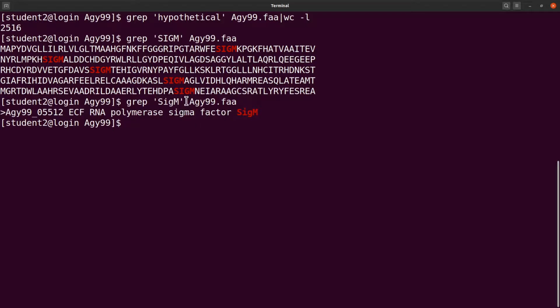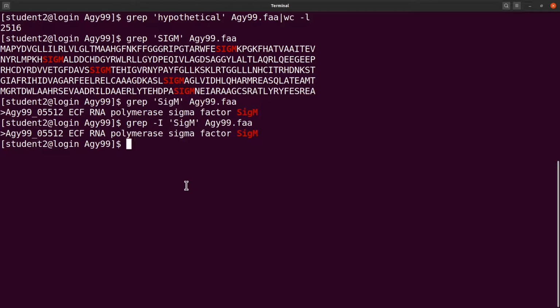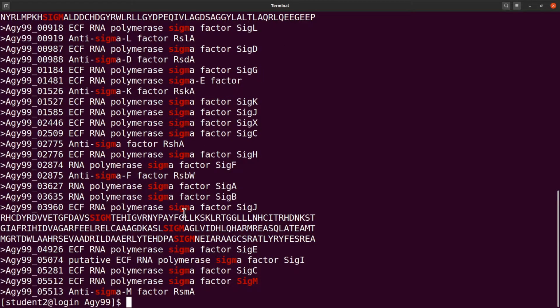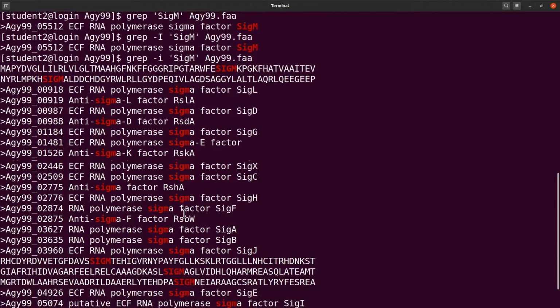So if you are using grep, you can also choose to ignore the cases. Then Bash will return any hit, no matter the case it is in, whether it's lowercase or uppercase. So in this instance, let's say we did this command here, -i, to ignore all cases. Let me issue it correctly here. It's lowercase here. Then we are going to have all the names appearing, regardless of the case.